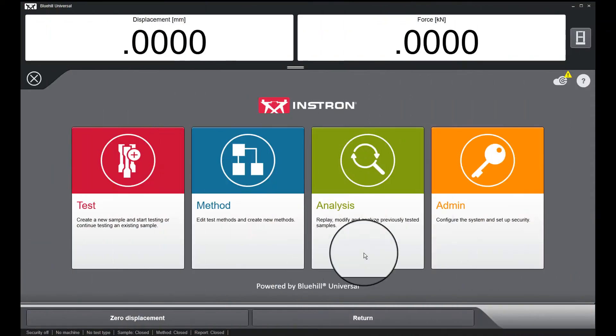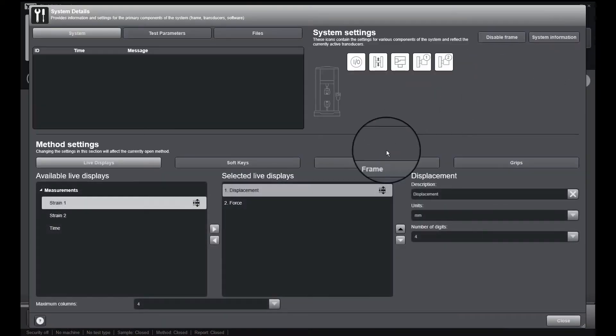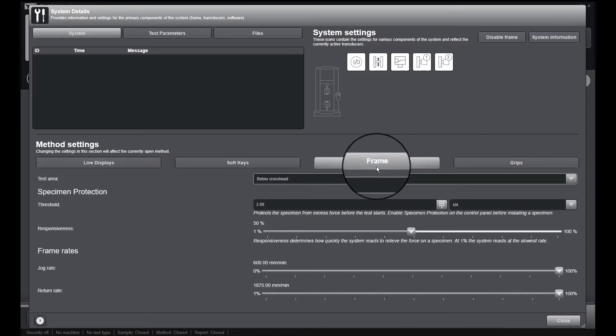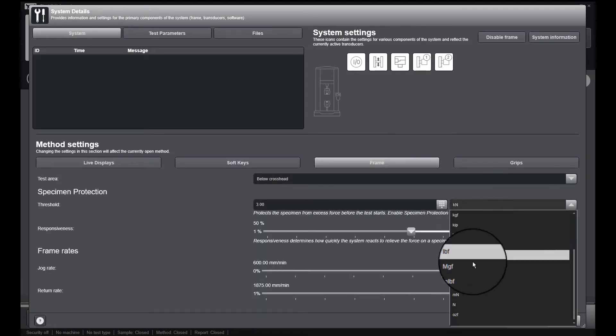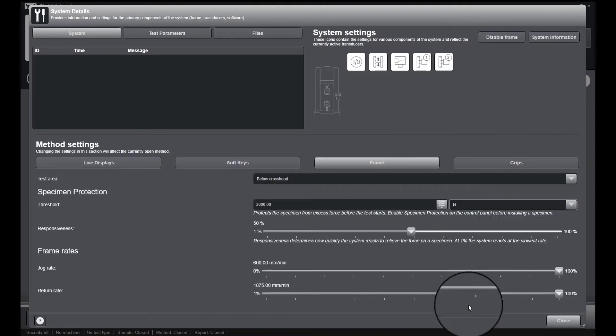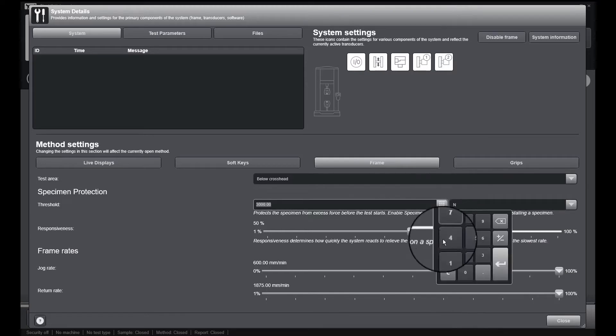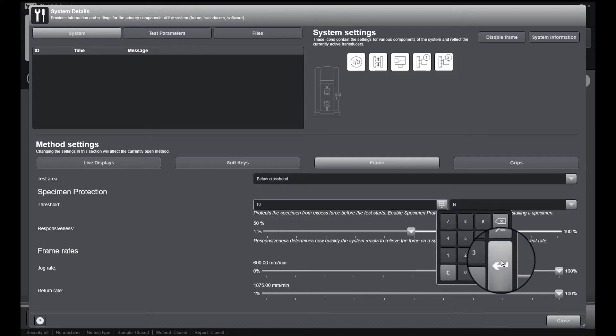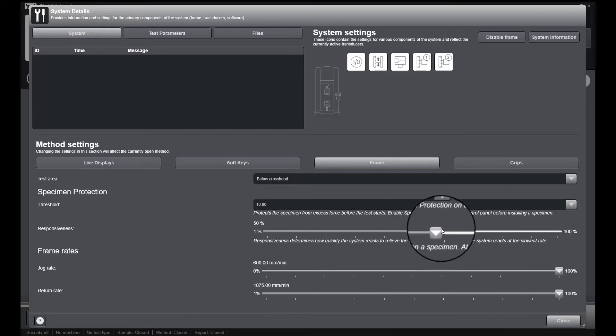The Specimen Protect load threshold is set within the Bluehill Universal software by clicking on the system icon and navigating to the frame menu. Here you can set your load threshold as well as the sensitivity. The sensitivity defines the speed at which the frame will adjust to reach the load threshold.